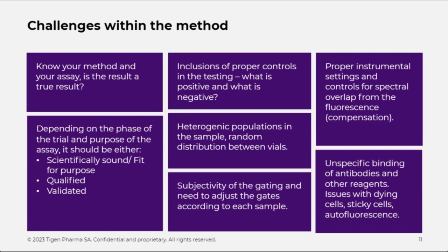It's very well known that when you set the gates that I showed before, when I talked about the basics of flow cytometry, it depends on the analyst and the panel that you have set up. So there is always a bit of subjectivity in the gating, and you always need to adjust the gate somewhat from batch to batch according to each sample that you are testing.